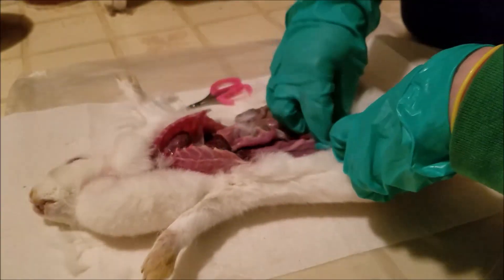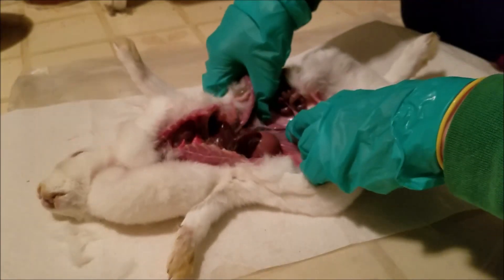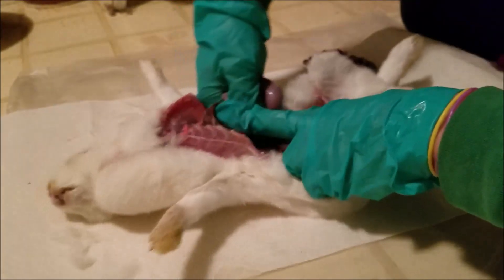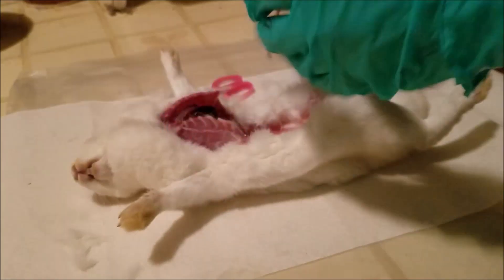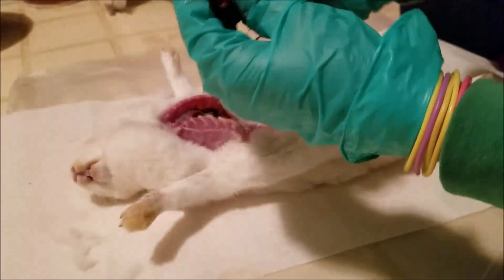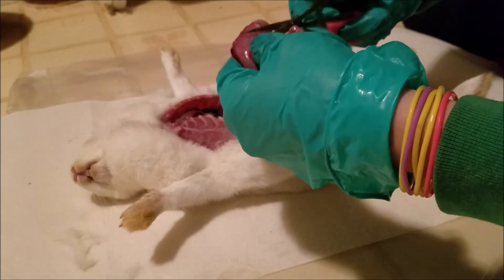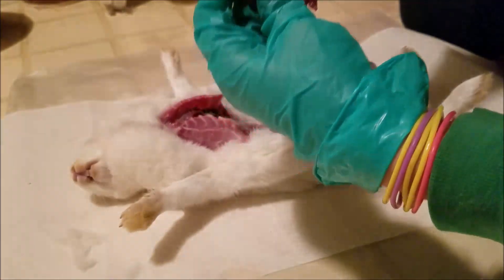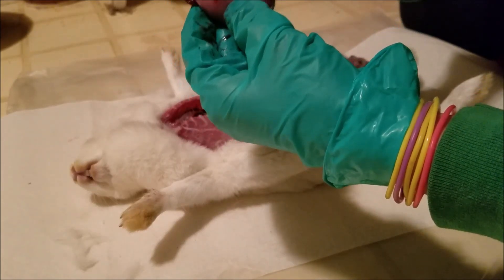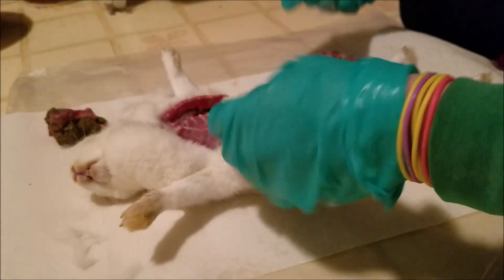Next we're actually going to remove the organs to get a closer look. Since this isn't really a meat rabbit, it doesn't really matter where you break off the intestines. Another thing to examine is the stomach — I don't examine the stomach until I pull it out, because I want to examine it very closely for any signs of hemorrhaging or ulcering. Her stomach looks beautiful; it was full, so she's been eating. Let's see what the contents are — just rabbit food, hay, pellets, and some of that grain I gave her. Okay, let's compare these kidneys side by side.